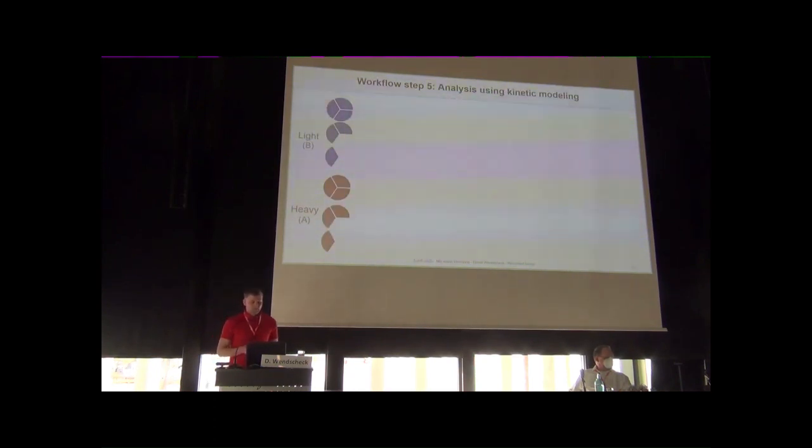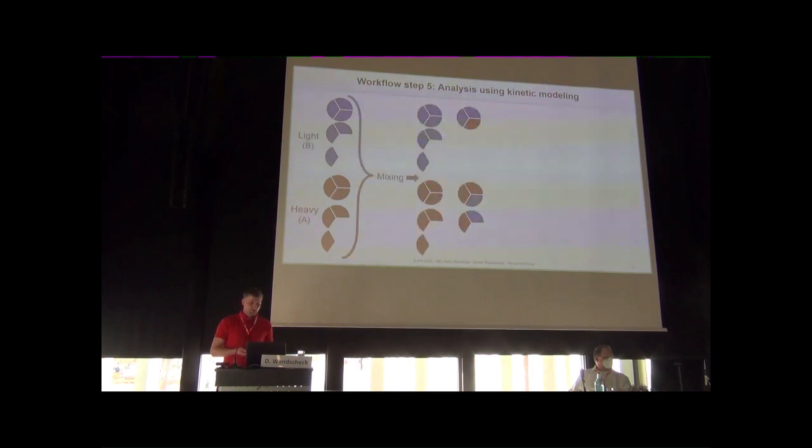In my experiment, I analyzed the PEX14 trimeric version. Since we have a light and a heavy copy, we have 6 different species. After mixing, we have in total 9 observable species of the reaction. And we can have a hypothesis about this reaction.